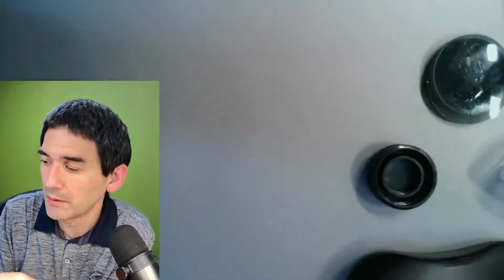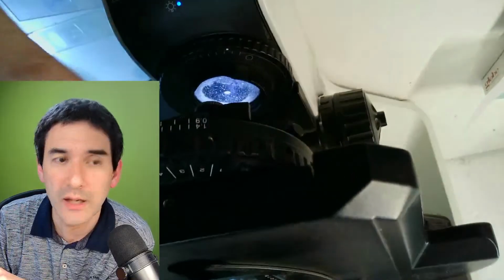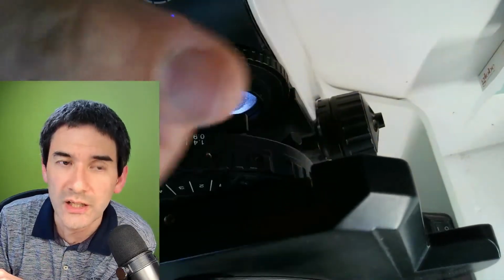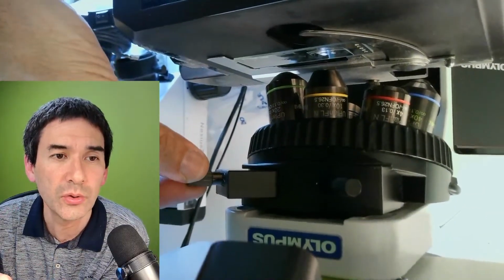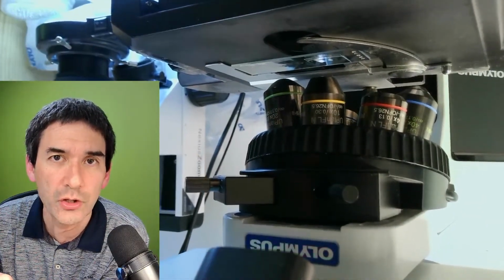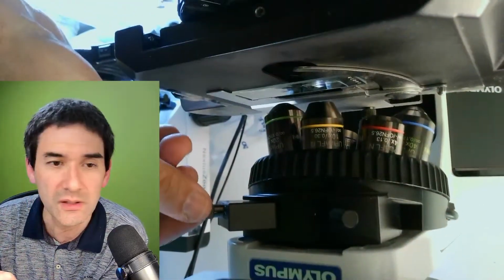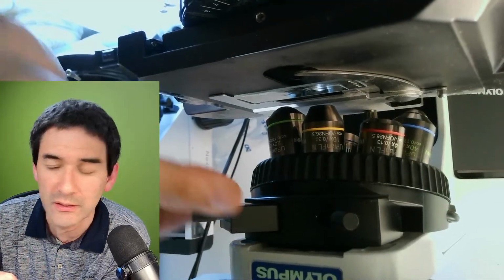Down here I've got a little wheel that I can turn to adjust the orientation of the polarizer, and up here, which is so difficult to see, this one over here, when I turn that, I'm able to change a prism around, and this changes the colors. And if I don't want to have it anymore, I can pull it out. So that's how the DIC setup looks like.